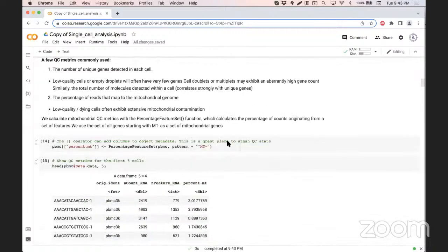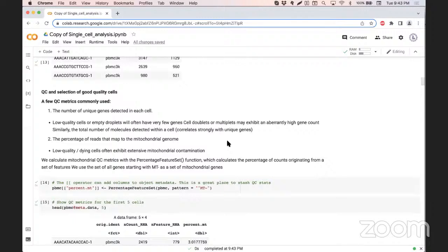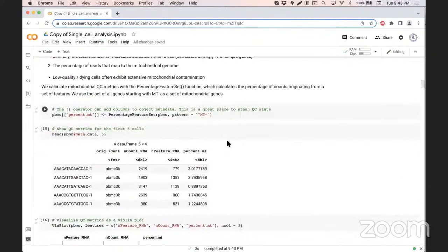And then we have to quickly go to quality control metrics. One of the quality control metrics that I mentioned is to identify the mitochondrial gene percentage, and then get rid of those mitochondrial genes. How can we do that?